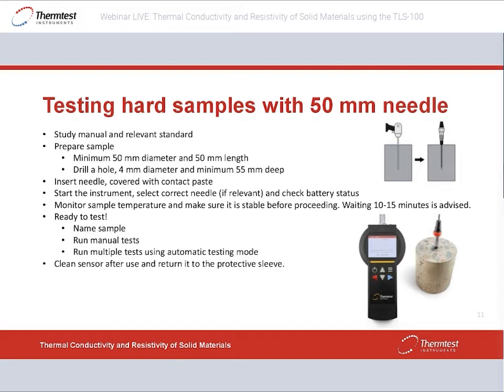Before you start testing, you should always study the manual and perhaps also the relevant standards, because in the standards you can get information on how to prepare your samples correctly in accordance to that standard. But for the testing itself, you need to have a minimum 50 millimeter diameter sample and 50 millimeter length, as discussed before. We need to drill a hole in the center of this sample, as you see in the picture.